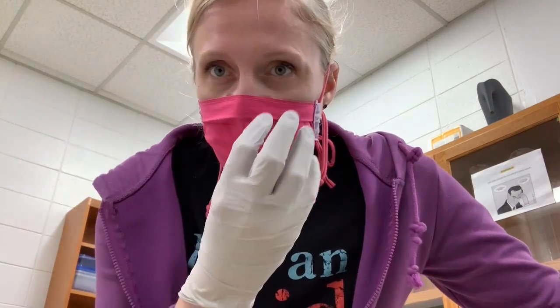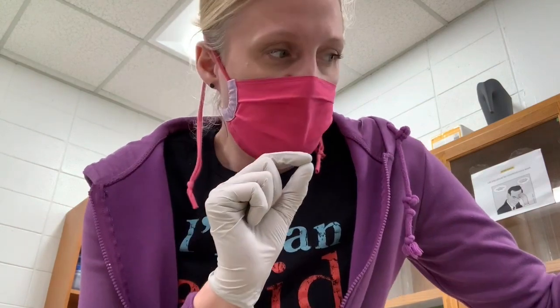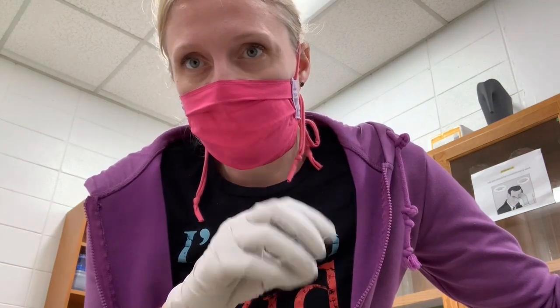So after this step, there's going to be a liquid in the bottom of the tube, and that liquid is going to contain all the materials from your solution except for the DNA, which is still going to be on that filter. And so we're going to discard the flow through, which is the material that comes down into the tube, the collection tube, and keep the column for the next step.